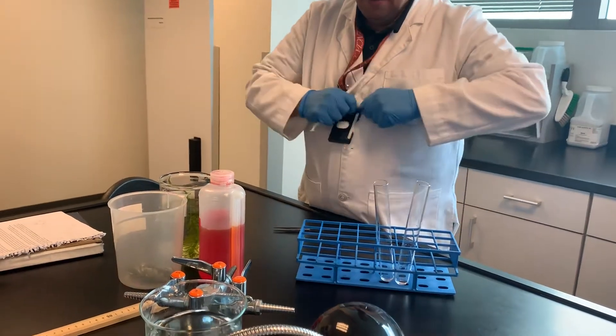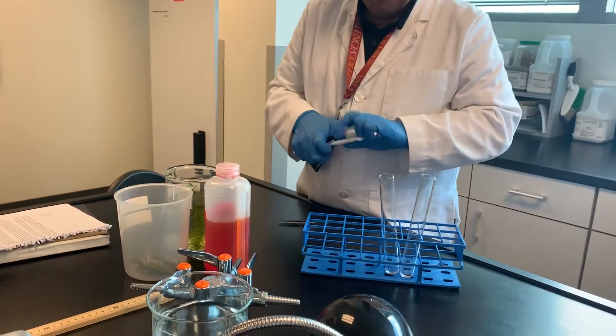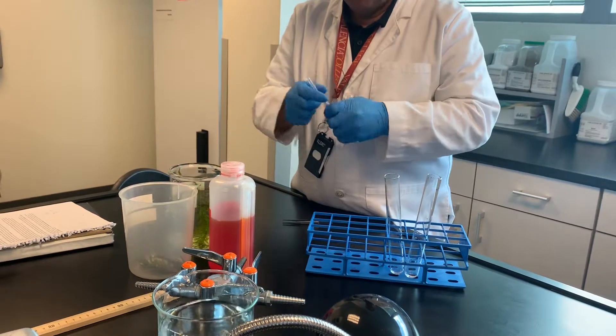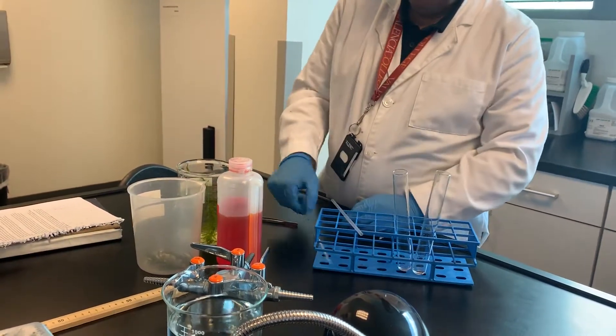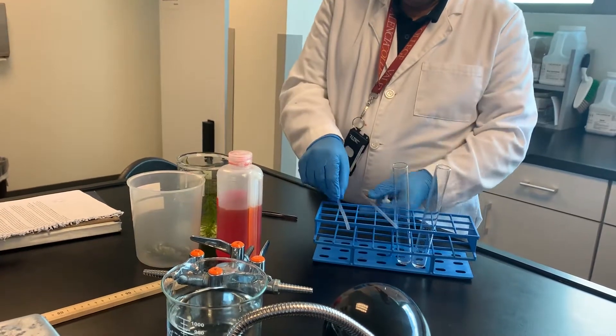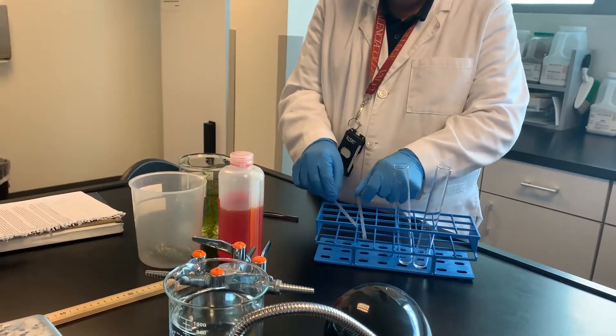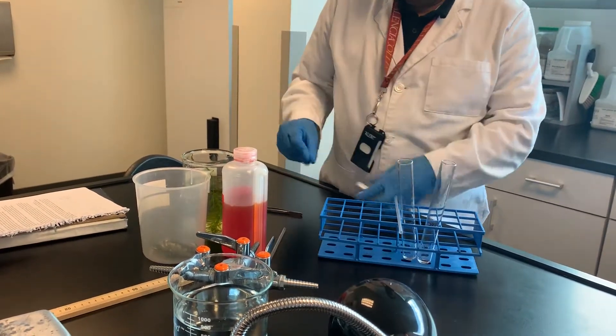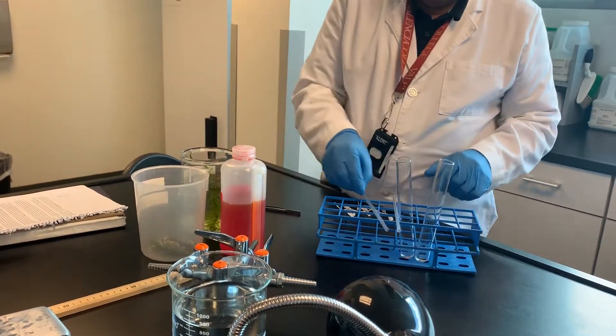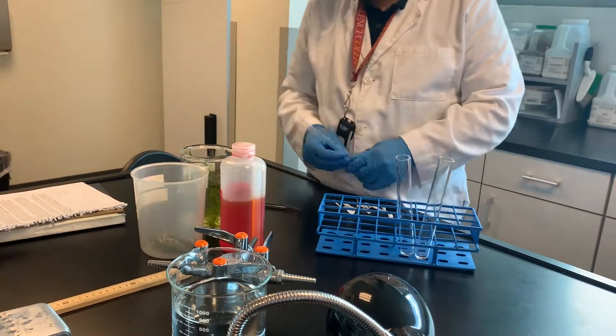For photosynthesis, we're using a technique similar to what we did last week with the phenol red. Remember last week we added phenol red and waited — we bubbled carbon dioxide through it.